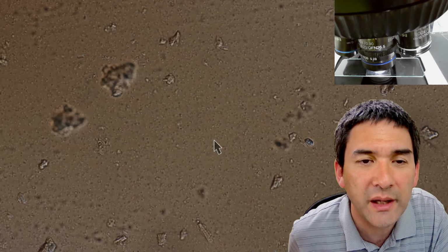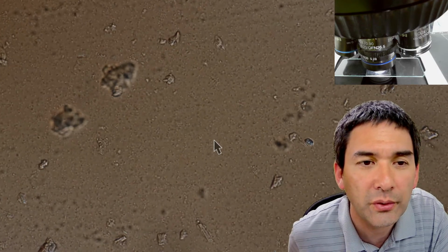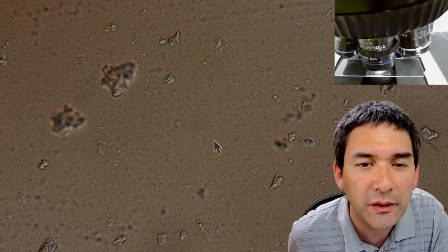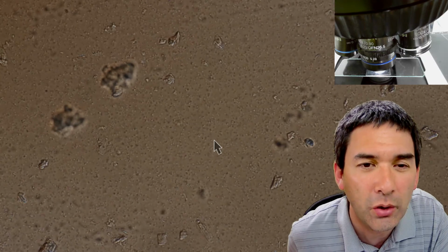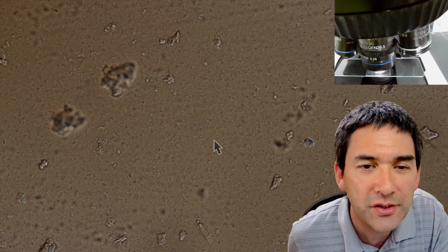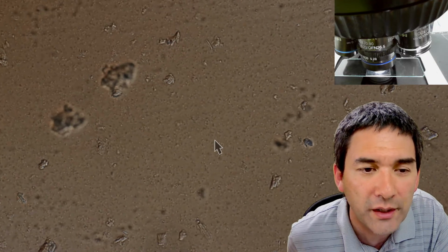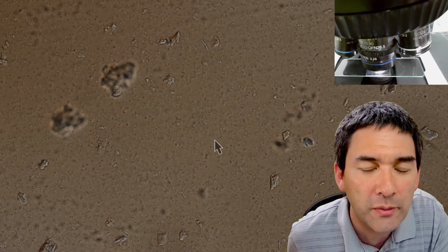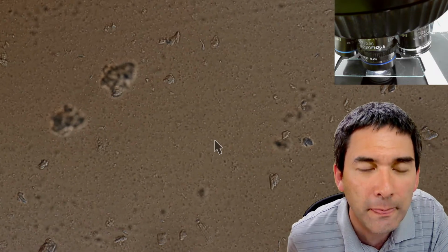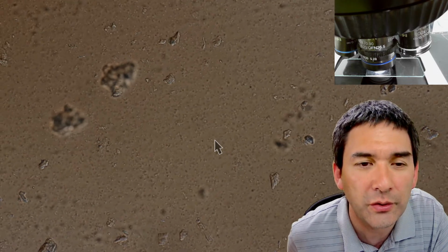So just because tiny dots move around does not mean that they move on their own. I think this is due to Brownian motion. And they look actually much smaller than the others. Maybe because they shrunk together because they were freeze-dried. As they absorb water, maybe they will become a little bit larger. It does take them some time to start dividing, and then maybe they're going to take on their original size again.